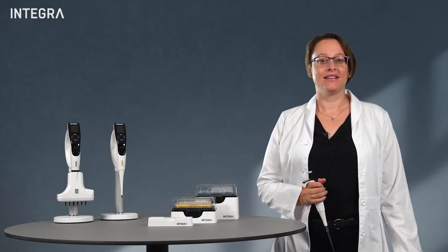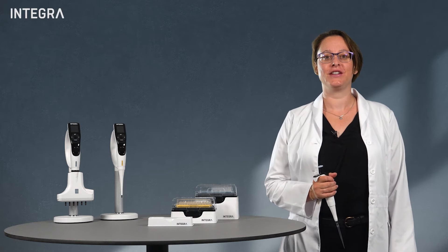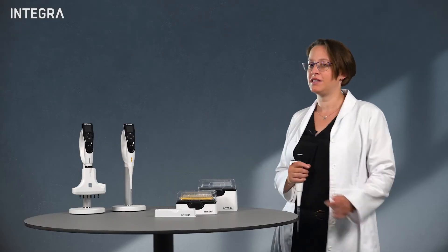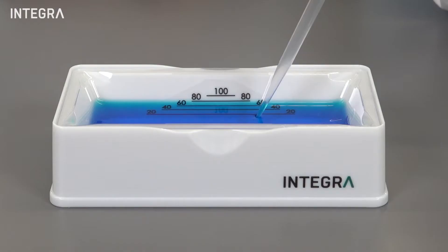Hello everyone! The most simple thing you can do to ensure the best pipetting result is to choose the right pipet. Should you be using a manual or an electronic pipet for the task you are performing?